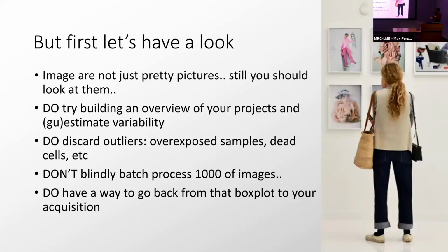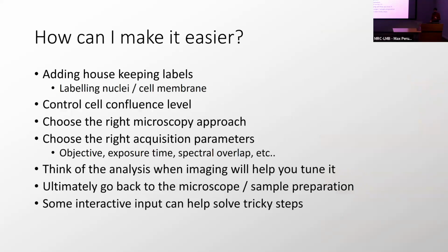And try to have a way to go from this box plot to the data you have acquired. So to say, okay, this is an outlier, what's going on here? And it's not easy.